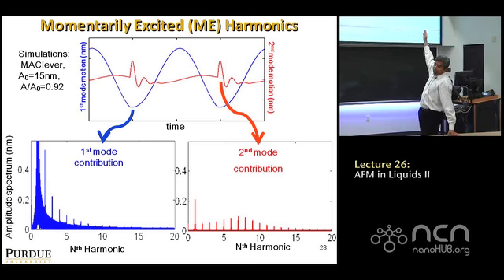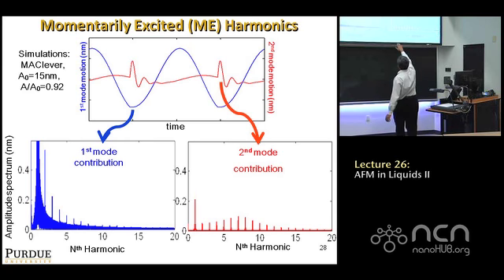But nonetheless, the key point is that the pulse you see in the red curve happens once every oscillation cycle. So if you do a Fourier analysis, the fundamental frequency of the red curve is also going to be at the drive frequency, because it happens once every drive cycle. If you do a Fourier transform, you find the red curve shows higher harmonics of the drive frequency, which reach a maximum value near the second bending frequency of the cantilever.